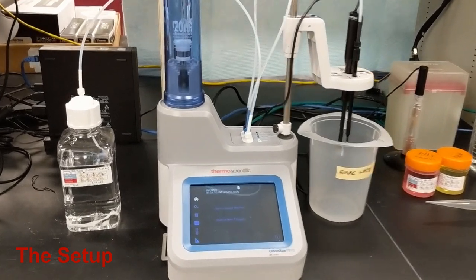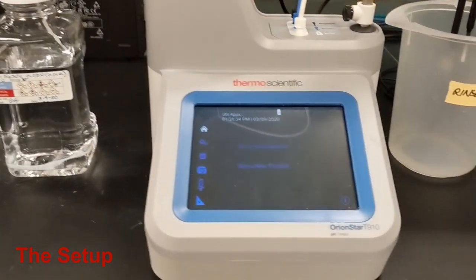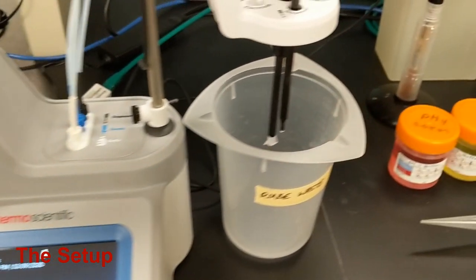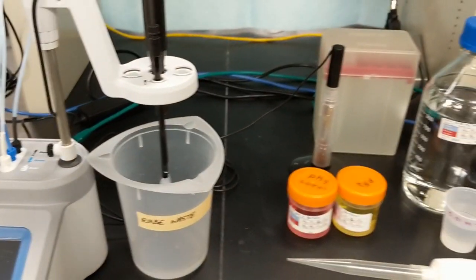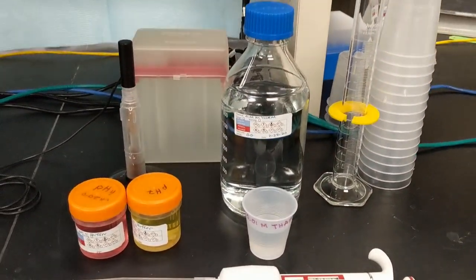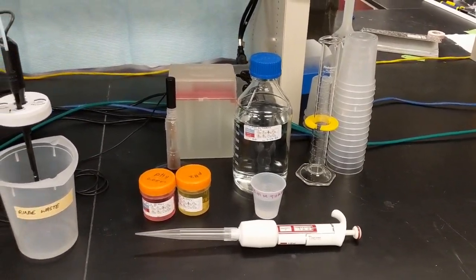Hello. Here is our low-level alkalinity setup, including 0.02 normal sulfuric acid titrant, our Orion T910 pH titrator, a rinse beaker, calibration standards, the electrode, a pipetter, the Trist solution for standardization, a graduated cylinder, and beakers.